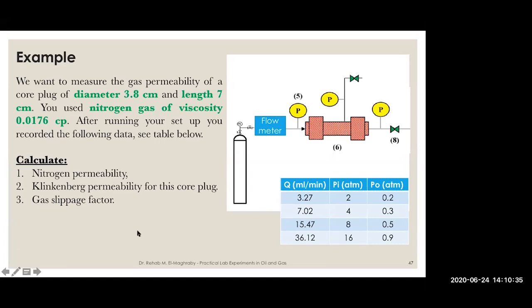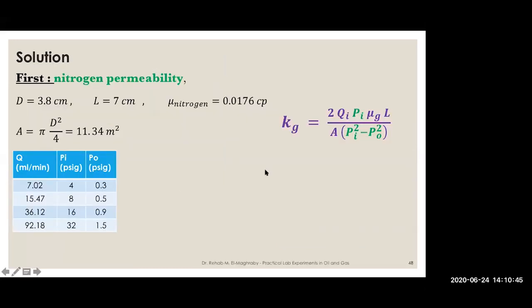Okay, so you have nitrogen. Can you calculate the nitrogen permeability? Can you calculate the Klinkenberg permeability? Or can you calculate the gas slippage factor? This is what we are going to do. We want to start first with how to calculate the nitrogen permeability.